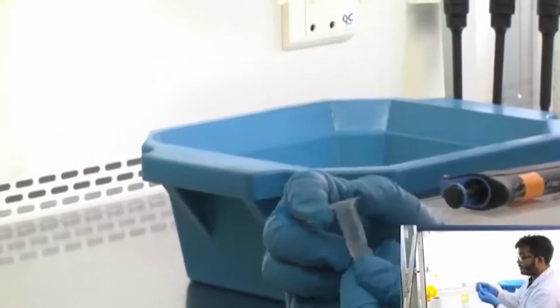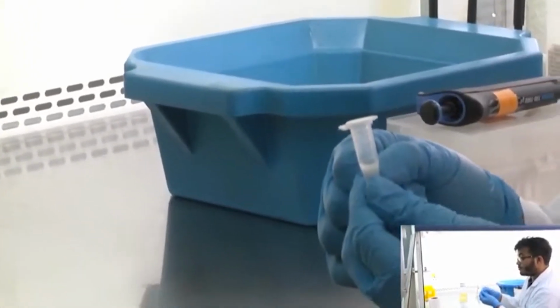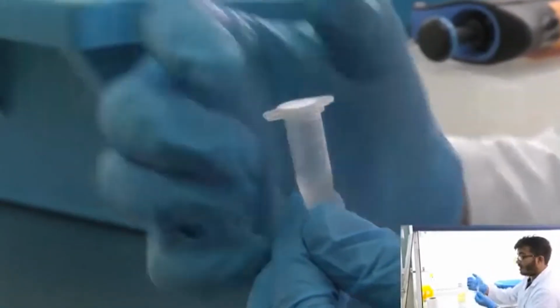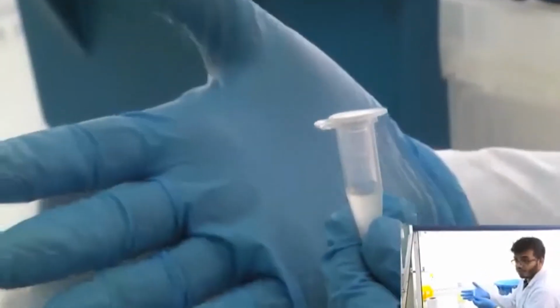I will again repeat that although the construct that we have has some antibiotic resistance, now we added plain media, we did not add any antibiotic, because till now the bacteria have not had time, after internalizing the plasmid, to start expressing the antibiotic resistance gene products.